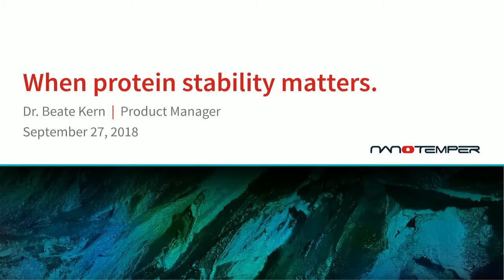Welcome, Beate. Thank you, Stephen, for the introduction, and thank you also to Thorsten for this great overview of how you approach developability assessment at Novartis. So we've already seen how Novartis uses the Prometheus in their workflow, and now it's my pleasure to give a broader intro to protein stability and to the Prometheus.